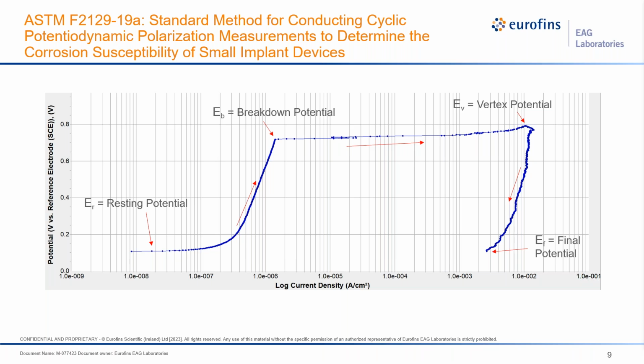So remember, I said this scan specifically here is consistent with a material surface that possesses corrosion damage, okay? This is considered a positive hysteresis and occurs when corrosion damage initiates and the passive film damage is not repaired.